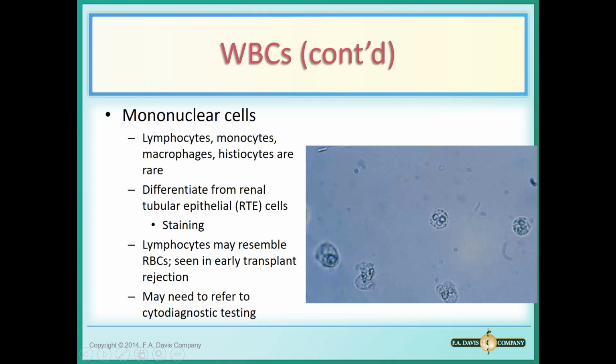This one has multi-lobes, so that's a neutrophil. This one, I don't know why that's here. This is not the best picture. None of these would I really call a mononuclear cell. Maybe this one. Not the best picture I've ever seen.